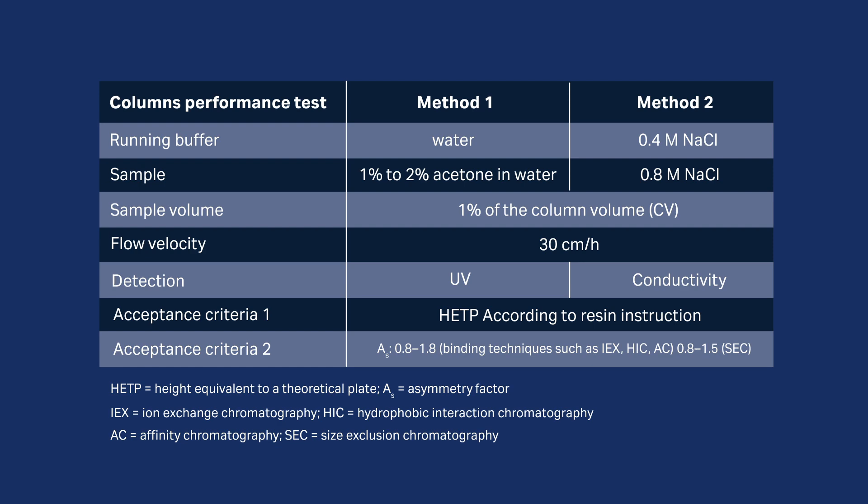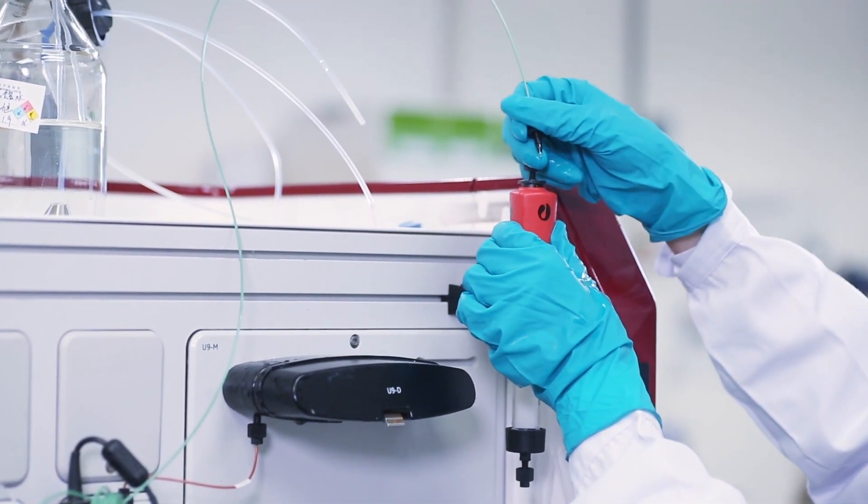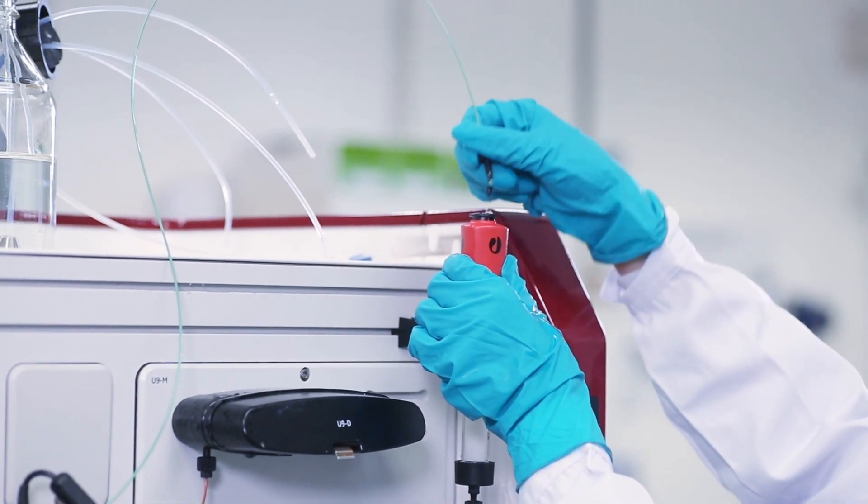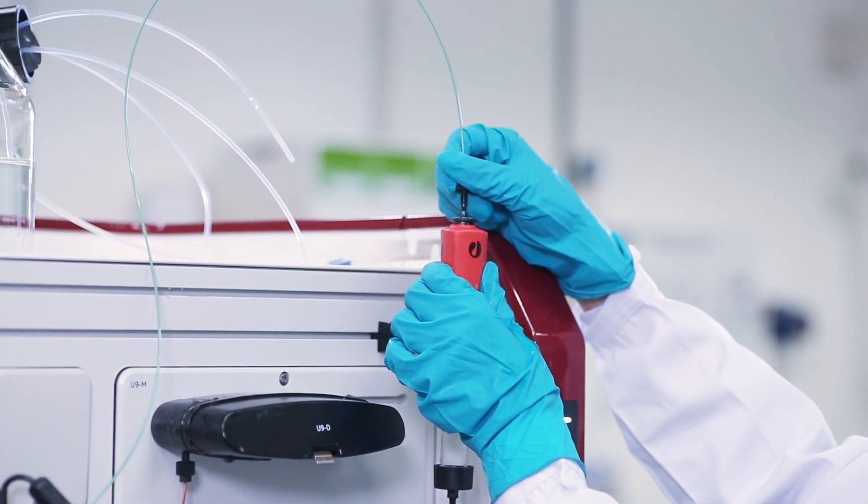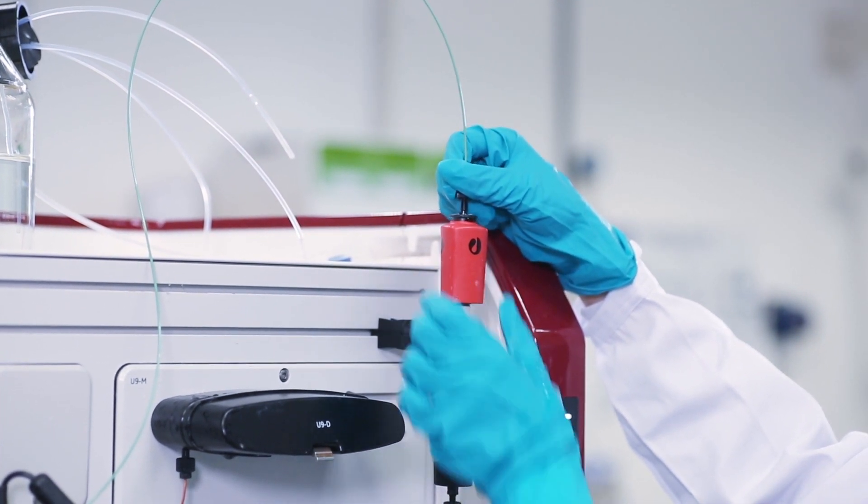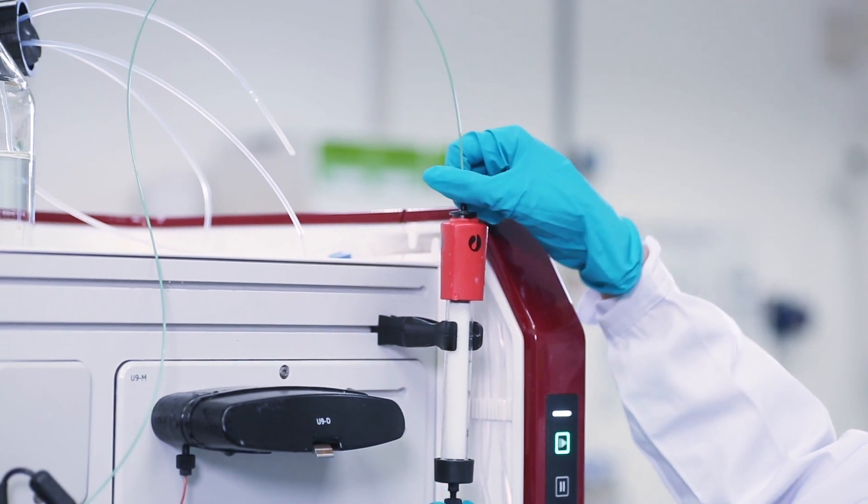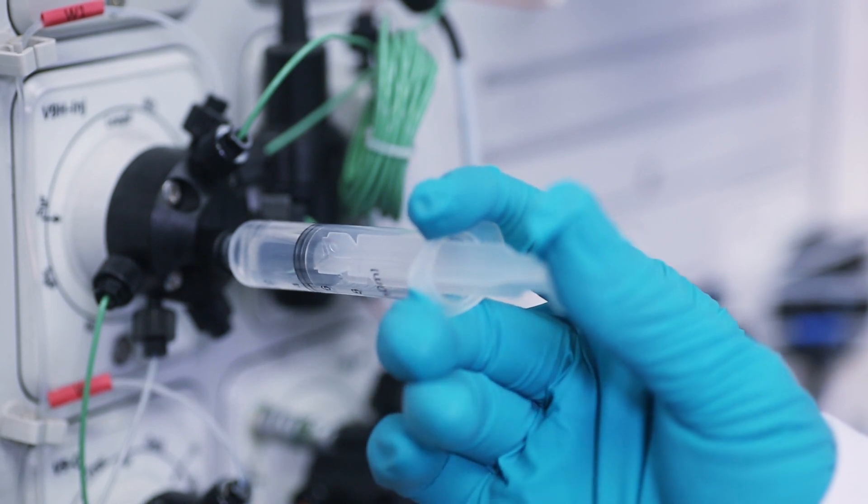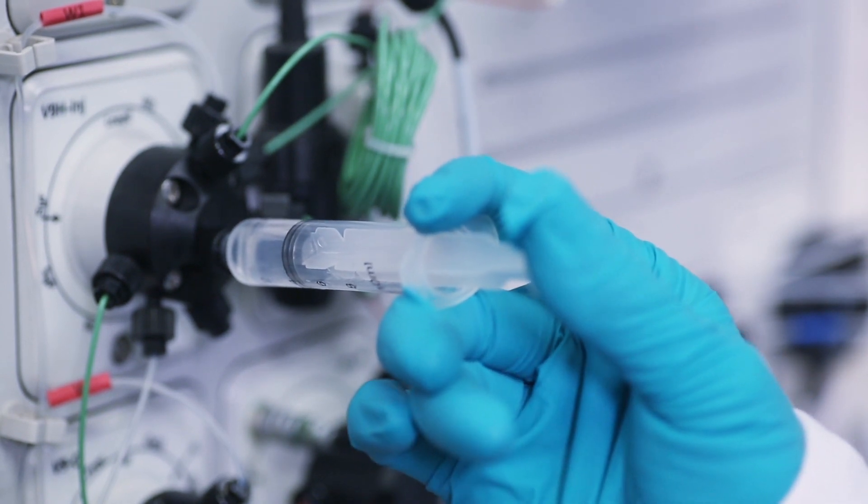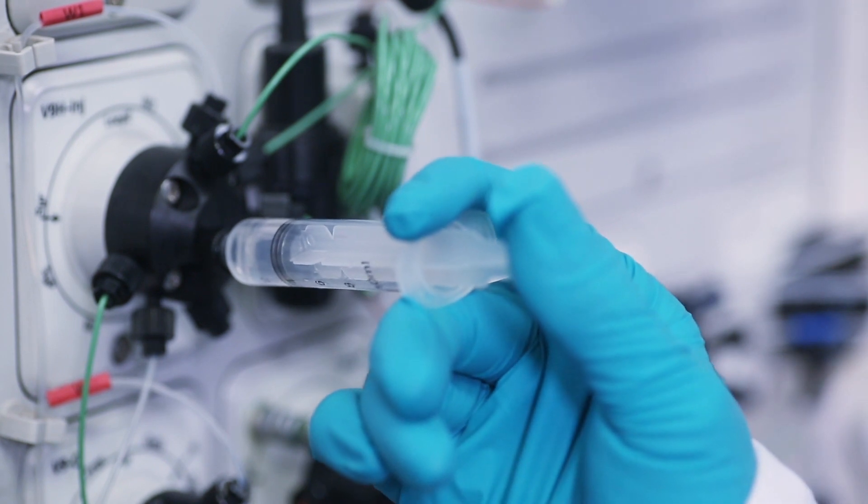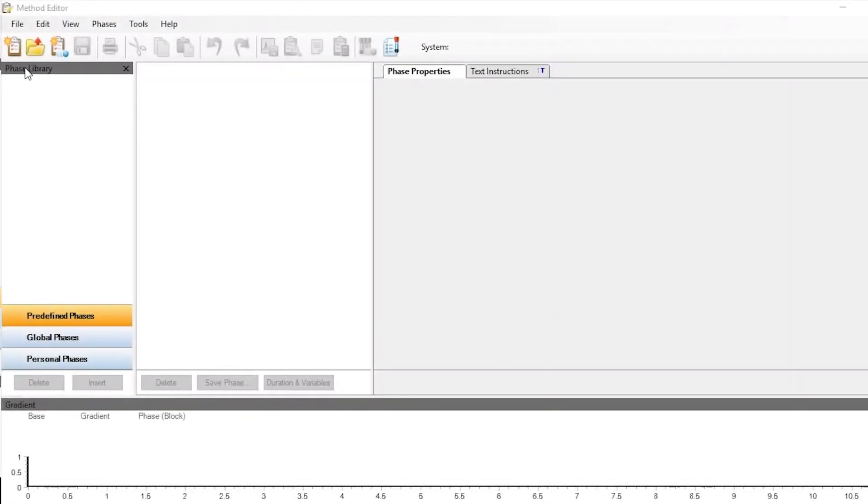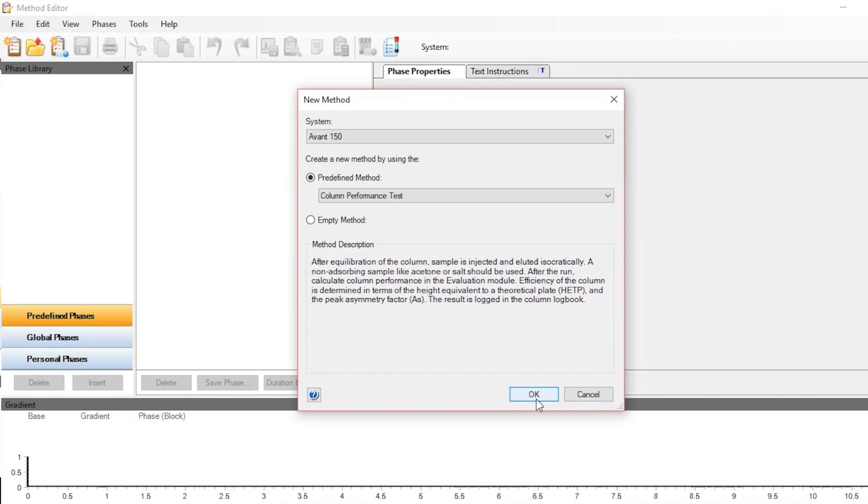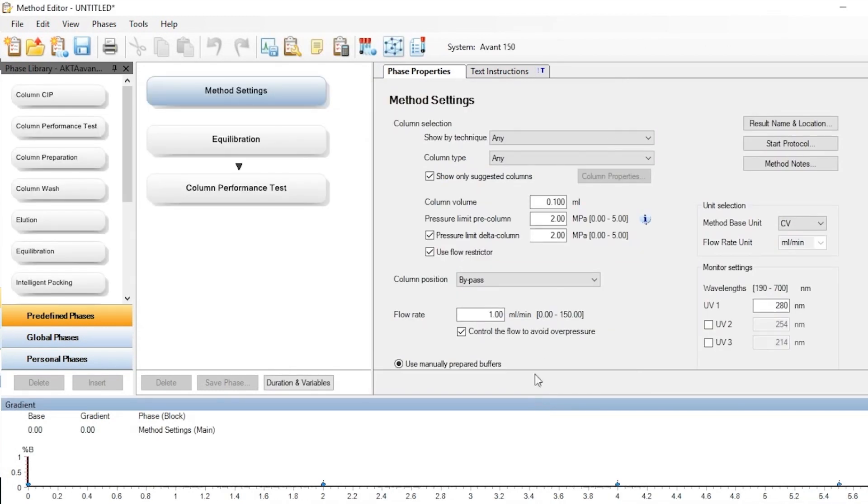Mount the column to the system and make a drop-to-drop connection. Use a syringe to inject the sample to the sample loop. In Method Editor, choose the column performance test template.